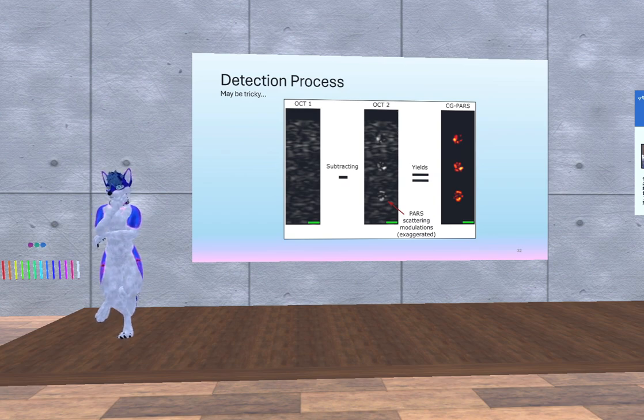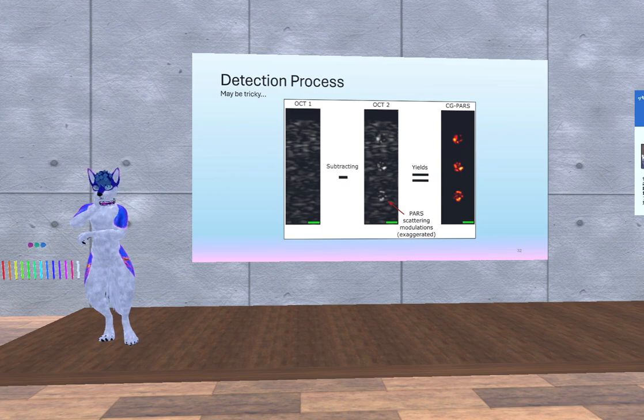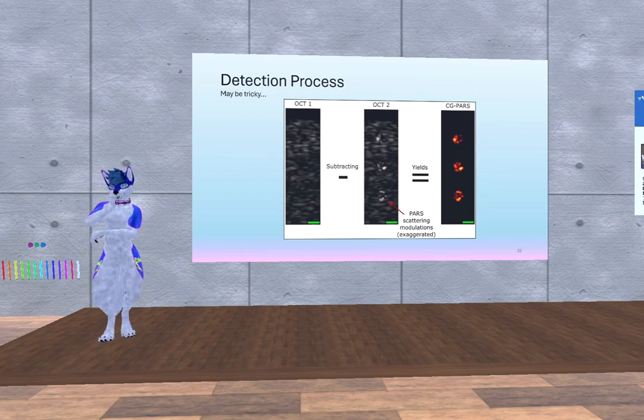Okay, so my secondary question would be, with the PARS technique, in the old past they would use an X-ray, and that would damage the DNA of the living things. But is the PARS technique, with the laser exciting the cell, a safer technique than what they were using, like X-ray?